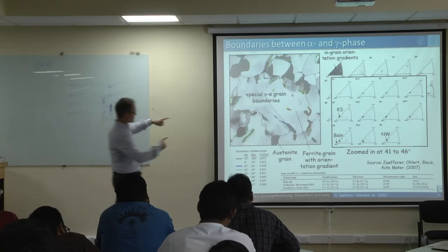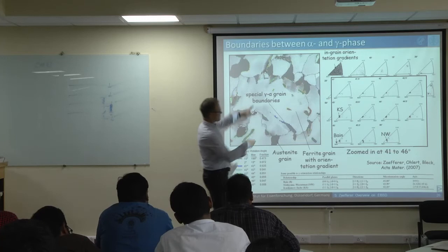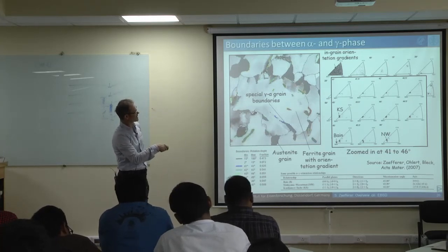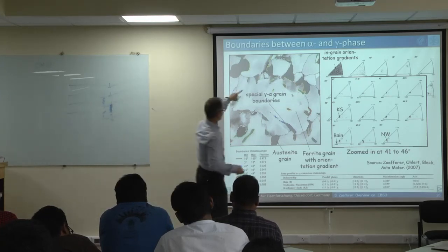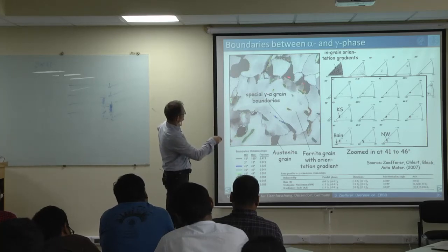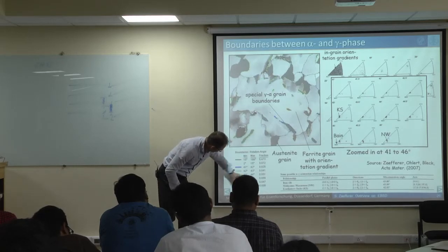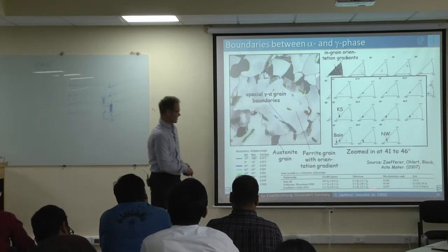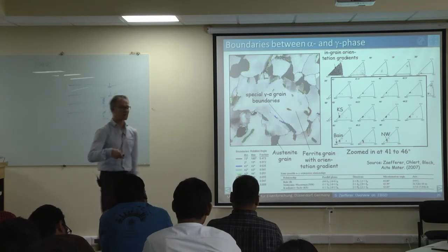But we see the misorientation is not constant. It is changing from place to place. And beautifully, you can color your grain boundaries to show which orientation relationship we have. And orange here, what I see mostly is orange between orange and green. So it's somewhere here in the order of 44 degree. And we could see which one is 44 degree. Now it's pretty much exactly, unfortunately, between Kurdyumov-Sachs and Nishiyama-Wassermann. Very close to Greninger-Troiano.